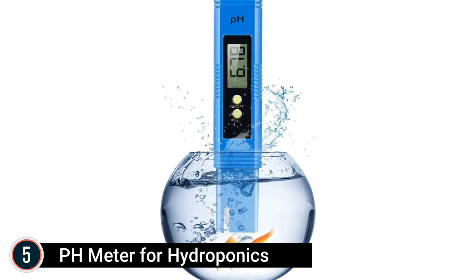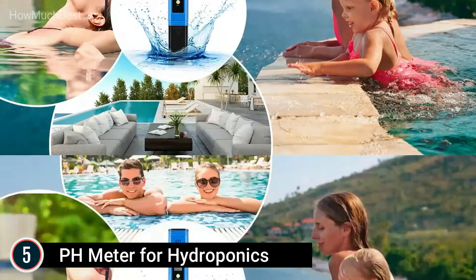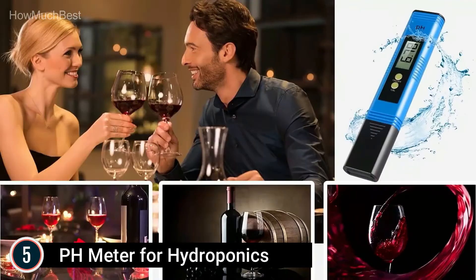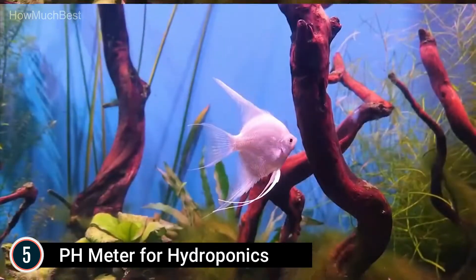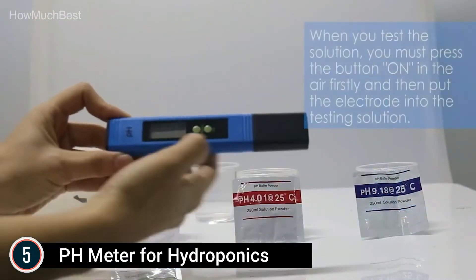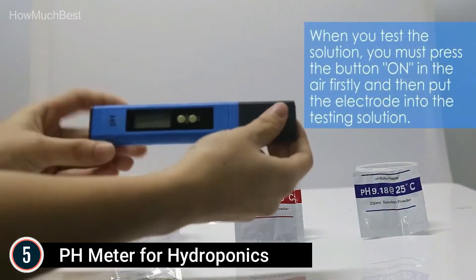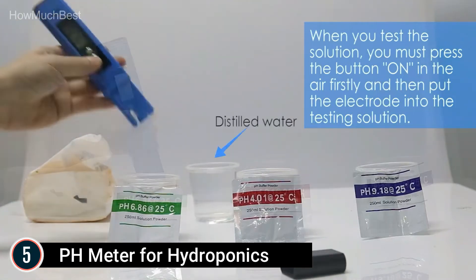Starting our list at number 5, the pH meter for hydroponics. Easy to use — every person can quickly get started with this pH meter for water. Turn on the switch, place the probe right into the water and stir, making the little glass ball totally contact the liquid. The value can be read when it is stable. The digital pH meter just takes a few seconds to show a precise and steady reading.